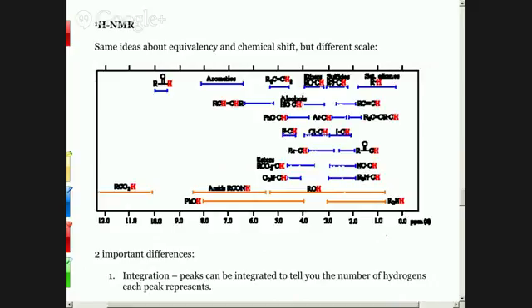There are other things that de-shield the nuclei even more, specifically aromatic rings, those rings that have alternating double bonds, have some special electrical effects going on inside them that pull those things way off. So a hydrogen connected directly to an aromatic ring is even higher on the spectrum. And then the very highest ones are connected closely with these carbon double bond oxygen groups. So a hydrogen or an OH with those carbon double bond oxygen groups, which I think you see in your spectrum. Because we know that our product from this reaction is acetyl salicylic acid. So you can look that up and see that it does have one of these groups. So that hydrogen way up to the left is the one from that group. You see that on your spectrum from today. I think everybody got a nice peak way over to the left, right?